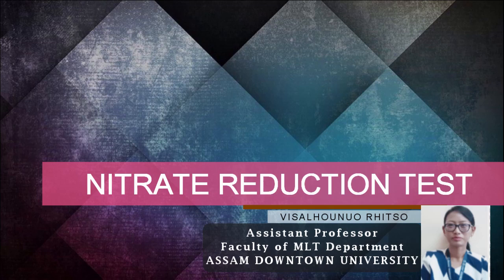The objective of this test is to determine the ability of organisms to produce an enzyme called nitrate reductase, resulting in the reduction of nitrate to nitrite, or to identify the different ways that nitrate can be reduced by bacteria.